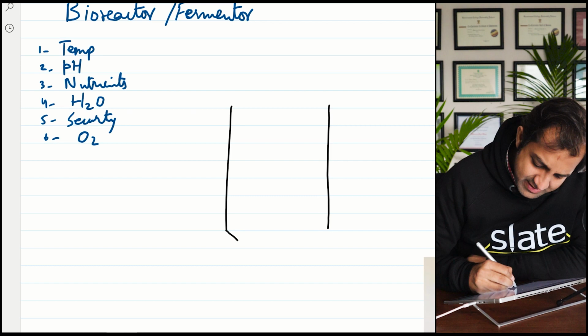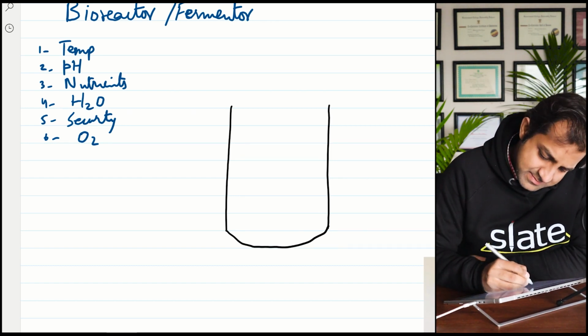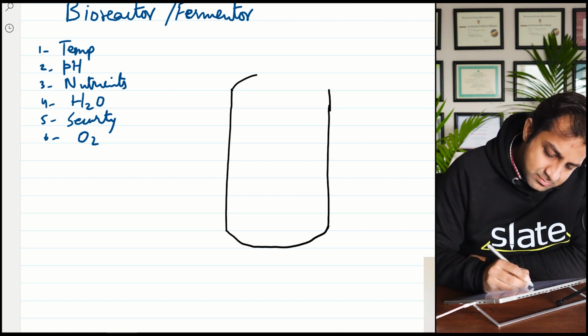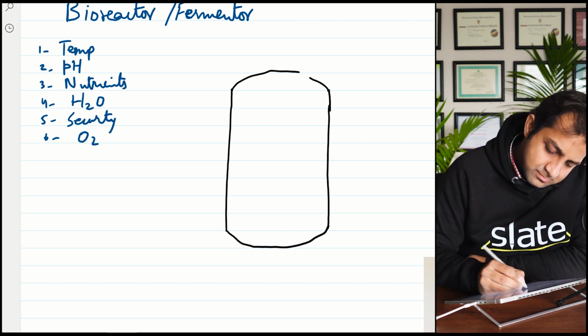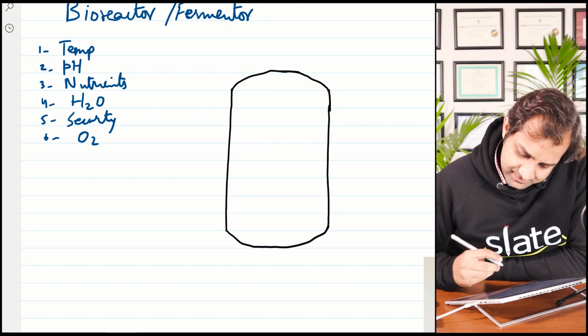So for this fermenter, we have a large vessel that is enclosed. But definitely it has some openings.